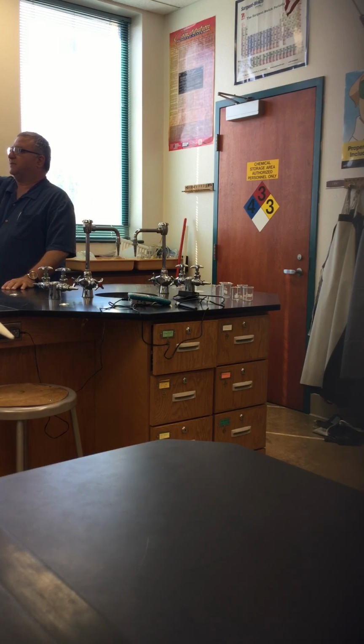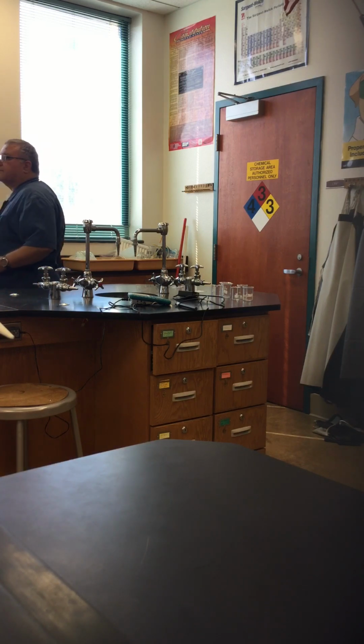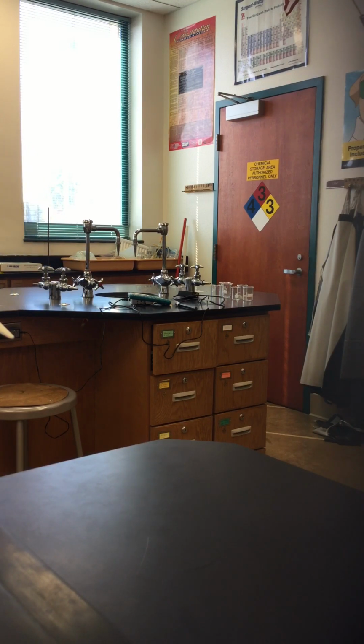There is a beaker, a bigger one, over there. Oh, some salt already. Useless.